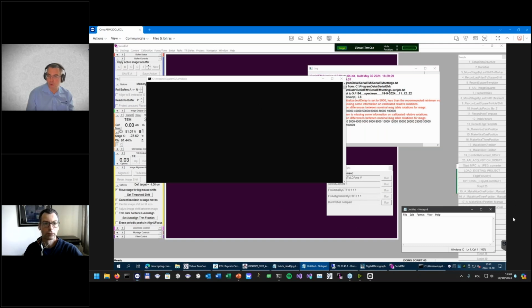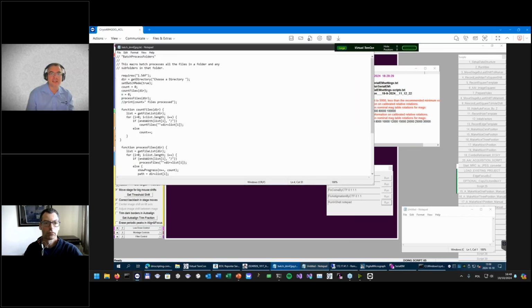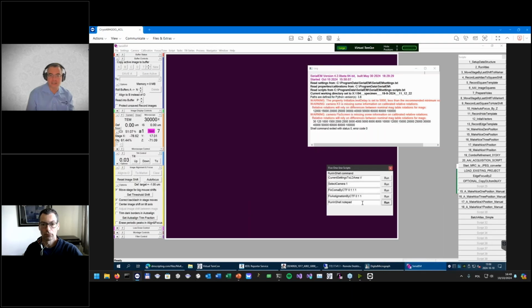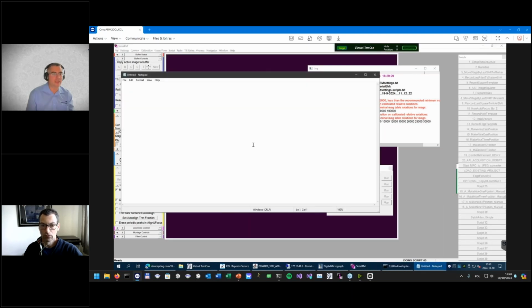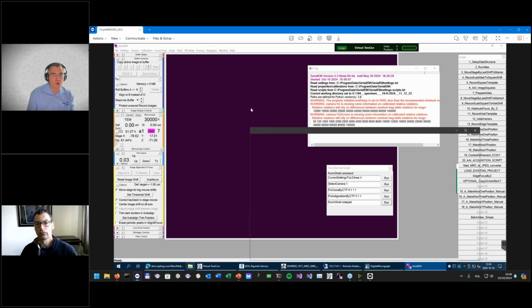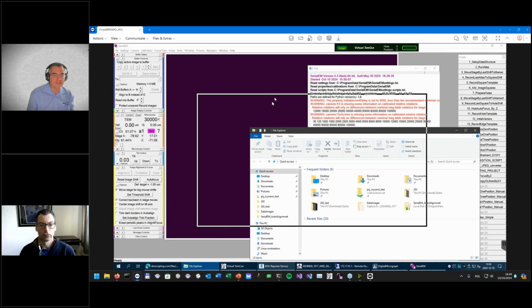SerialEM will launch notepad. In this case, yeah, here we go. You see it opened. Maybe not everyone saw that. So let's again, if I close it, yeah, here we go. We've got notepad running. As a part of Virtual TemCon, we do provide a small tool that is called VTC call.